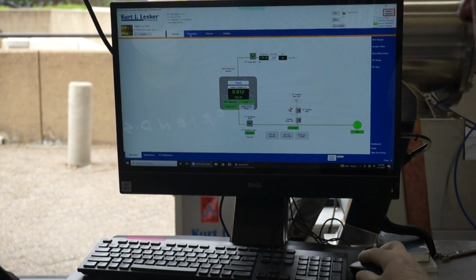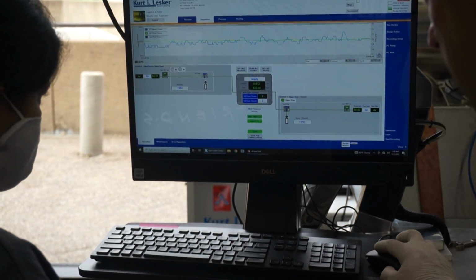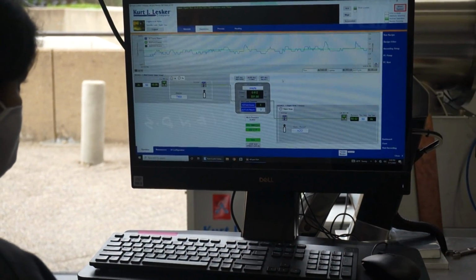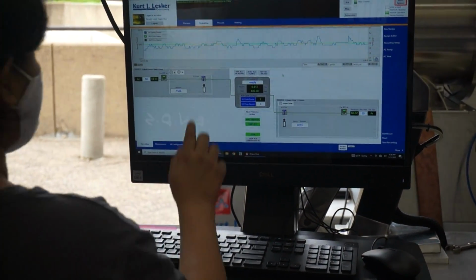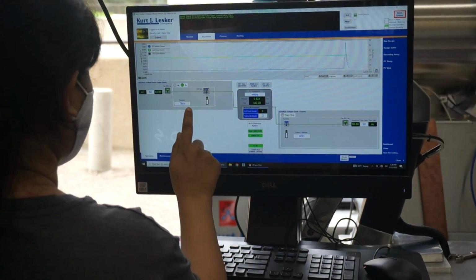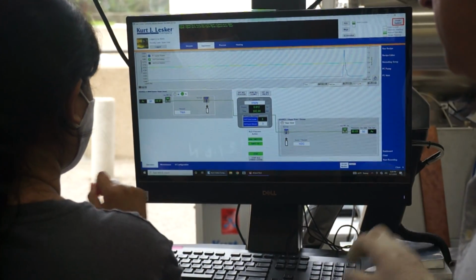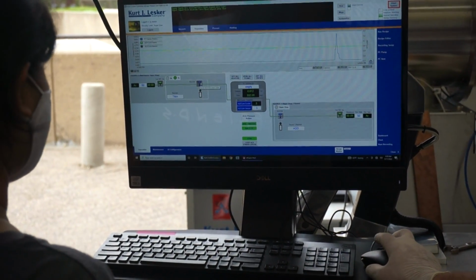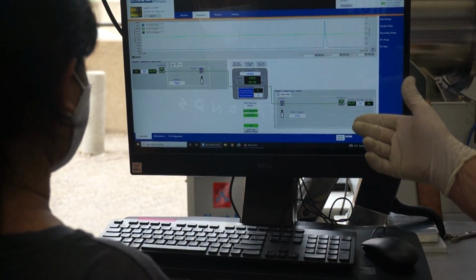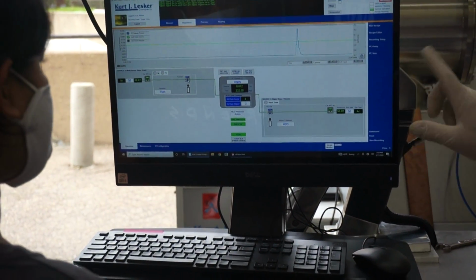We're coming back. We can go back to the deposition. We can go ahead and close the valve. Now we can go back to where we were at. Go try to open it again. Yep. And close it. Close it. Use a mouse. So that was one long time. And do it 2 more times. Just like that. Open and close.